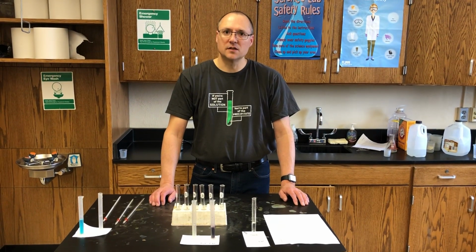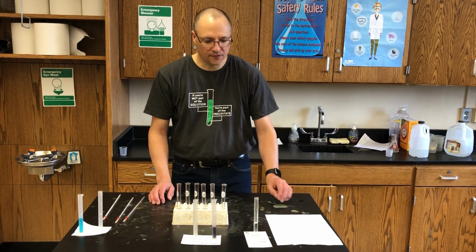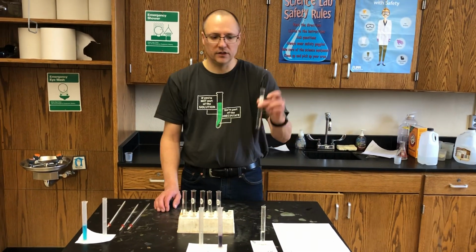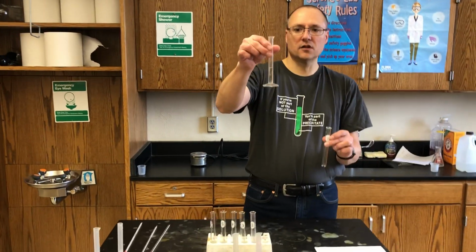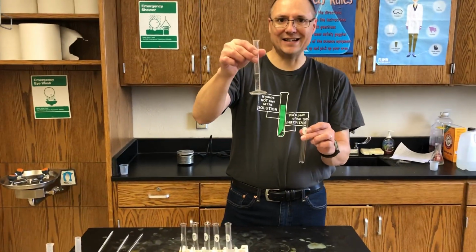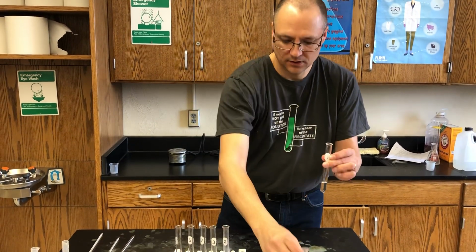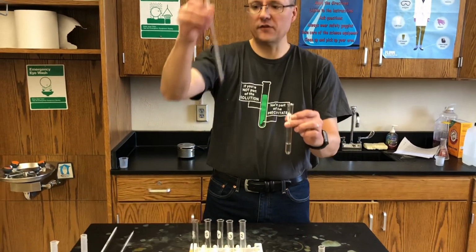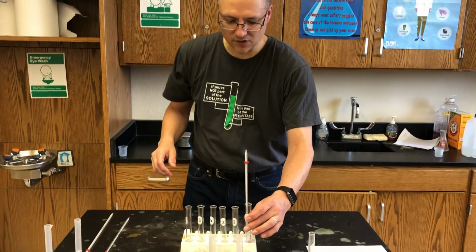This is Mr. Wise, and this is part one of the Identifying Chemical Reactions lab. In the first step, in test tube number 1, I have measured out 4 milliliters of hydrochloric acid, HCl, and I'm going to pour that into test tube number 1. Then I have a thermometer, and I'm going to put the thermometer into that test tube.